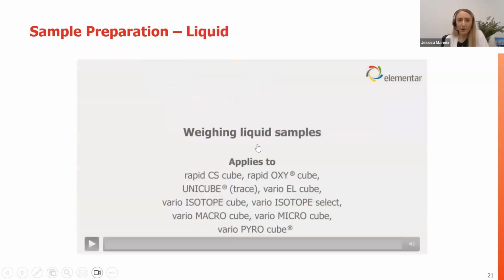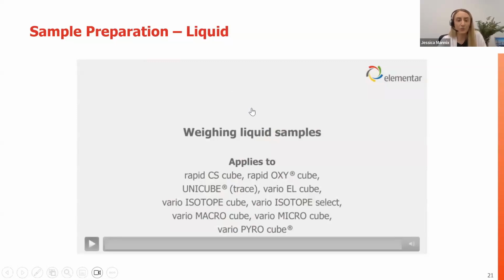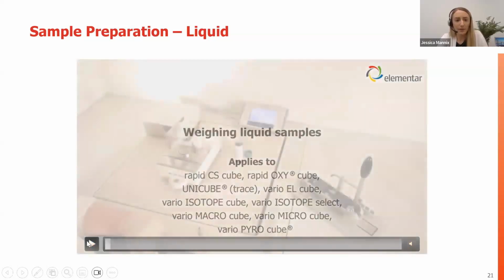I did mention in the beginning that we also have the ability to analyze liquid samples in addition to solid samples. And so I just wanted to make sure that we displayed what that would look like as well. I know soil extracts come up a lot and things along that line. So let me mute this once more.